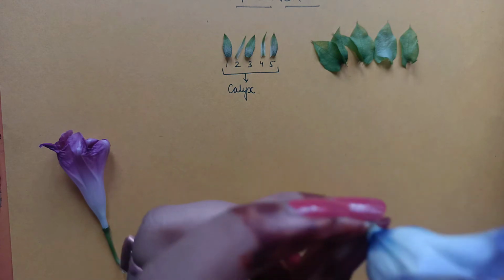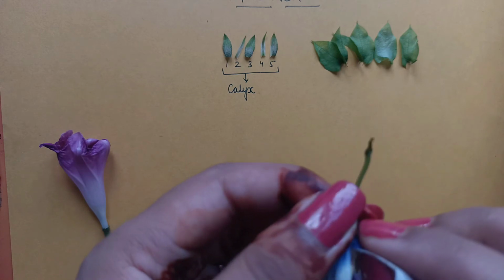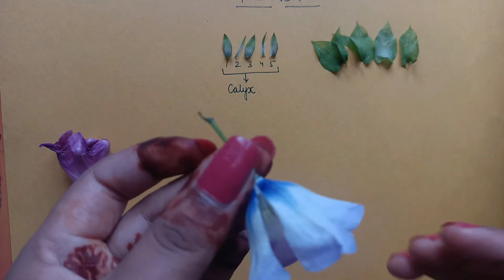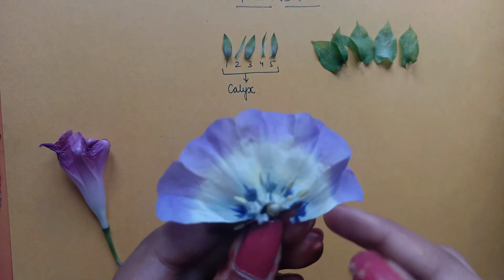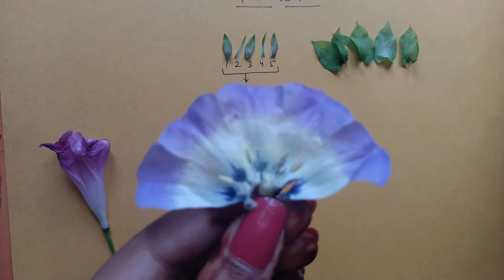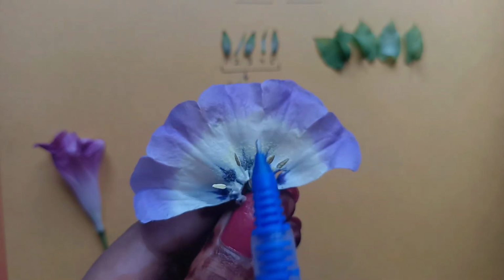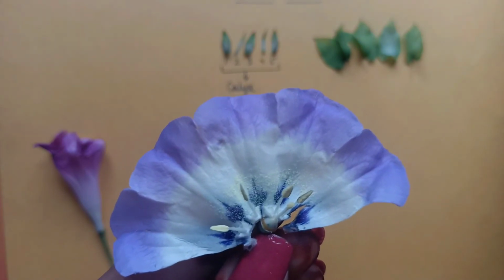Now if I just remove these petals, be careful while you're removing. See, this is a joined petal. In some flowers the petals are free, separate, like in your rose flower. Now you can see over here the petals, and they are joined. If you look carefully, you can see something yellowish over here. You can see this yellow color. So what are they? They are the pollen grains that we have studied.